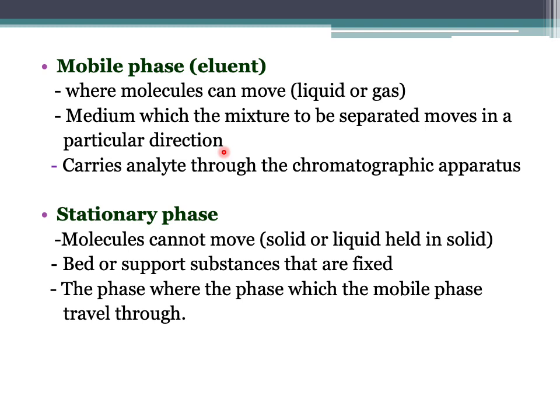Dia akan bergerak melalui stationary phase, melalui satu direction. So, dia akan separate. Okay. Carries analyte through the chromatography apparatus. So, mobile phase ni dia bawa analyte melalui apparatus chromatography tu. So, itu adalah mobile phase or eluent.